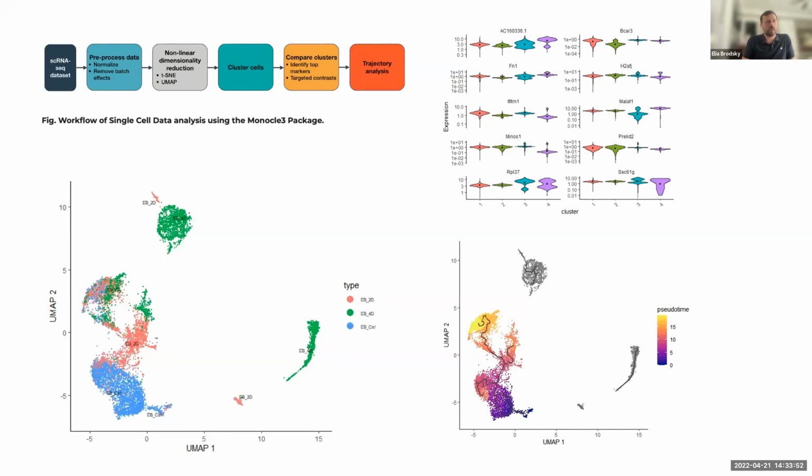So we were able to not only work through the process of eliminating some of the noisy data that came with the project, but also perform all of these tasks in a very short period of time, and then start asking those specific questions about what are the marker genes and how do these marker genes behave across time and between different cell populations.